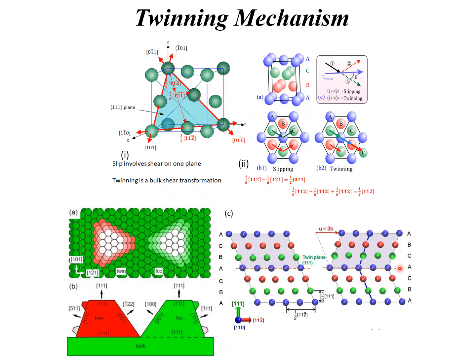The second undistorted plane in twinning parlance is, and I don't have an example of it here, I was in another lecture about twinning, whatever plane is recognizable as the same plane before and after the shear. Now this represents a cubic crystal, and for the cubic crystal, all the planes are undistorted after the twin, after the shearing operation. But in hexagonals, that's not the case.